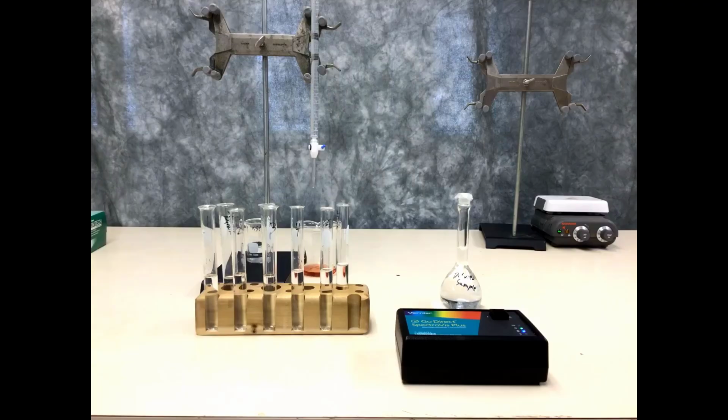We are now ready to analyze and try to determine how much iron is in our sample. To do this, we're going to use Beer's law, and we need to make standards like we did in our previous lab. In this case, all of our standard solutions will be made according to table 1 in your lab.